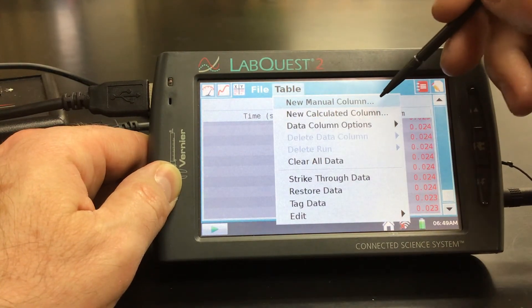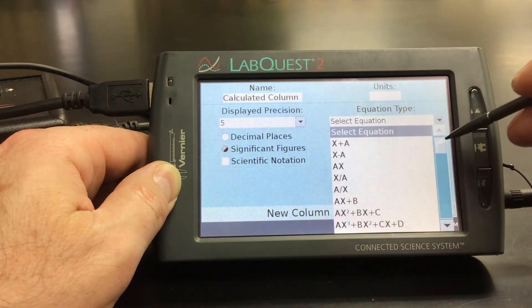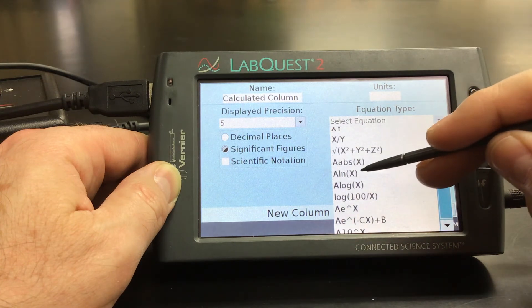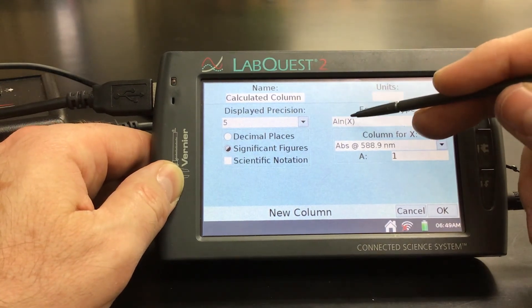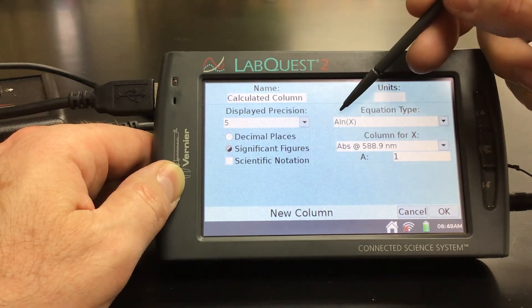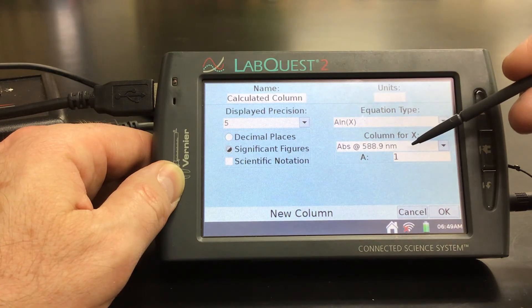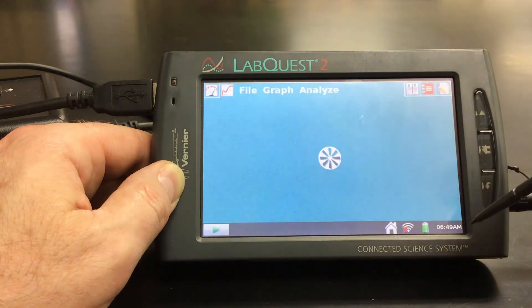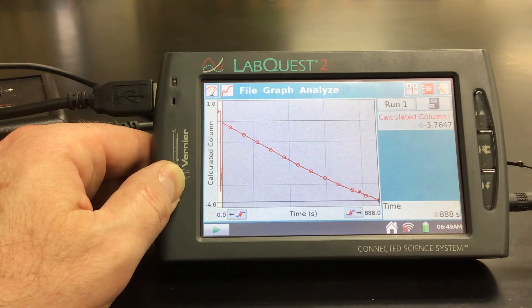The first thing we can do is select the equation type. We're going to select the natural log of our absorbance. It's taking the natural log of X, where the column for X is the absorbance — that's what we want. We're going to hit OK. And then it shoots us back to our graph, and we ask: is that a linear relationship? Well, it sure looks pretty linear to me.